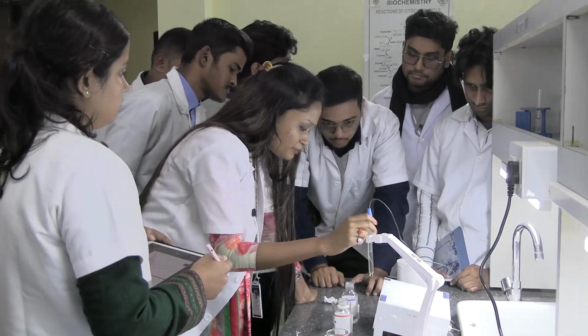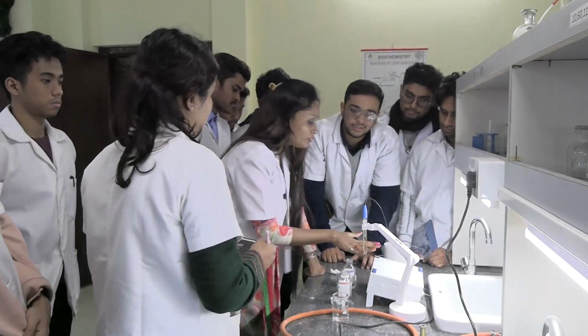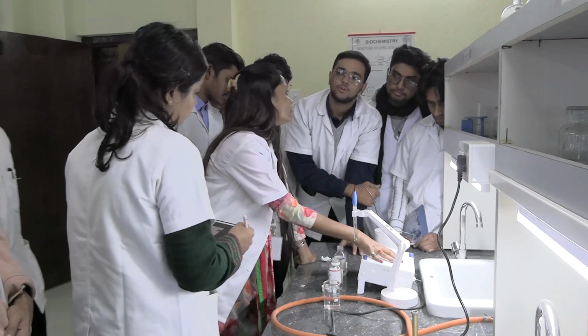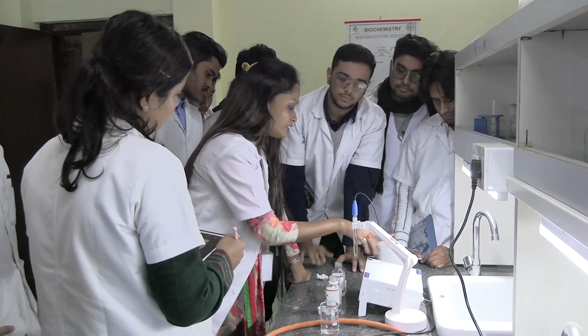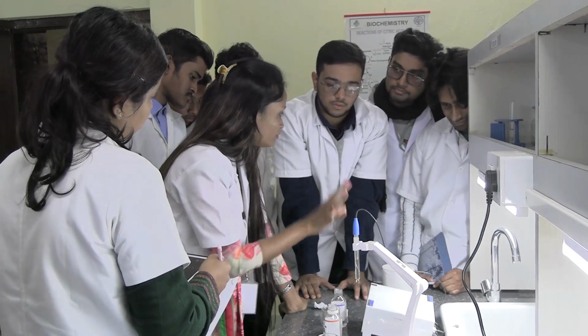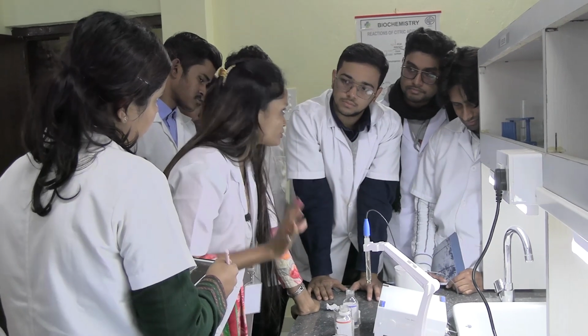For your exam purpose, this will be your spotting. You should know what the instrument is, what the principle is, what the function is, and if the examiner asks what the procedure is, you can describe the procedure.